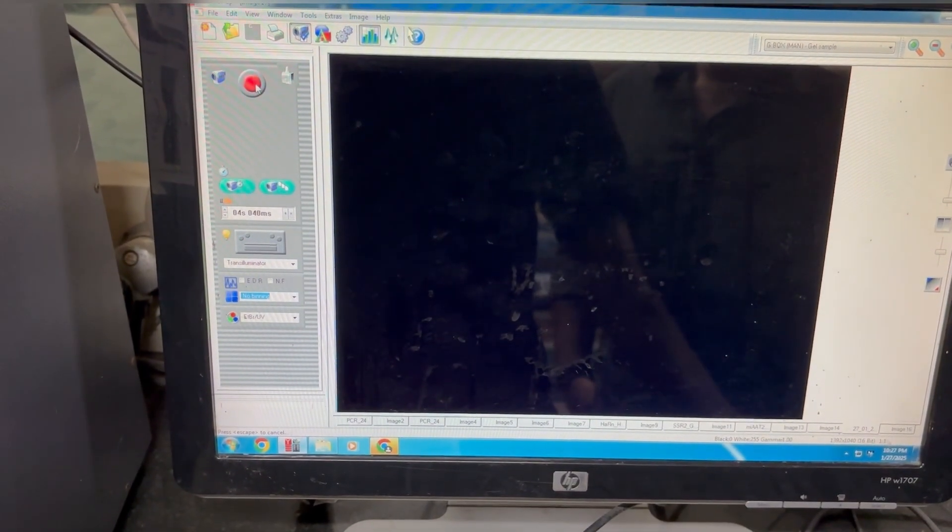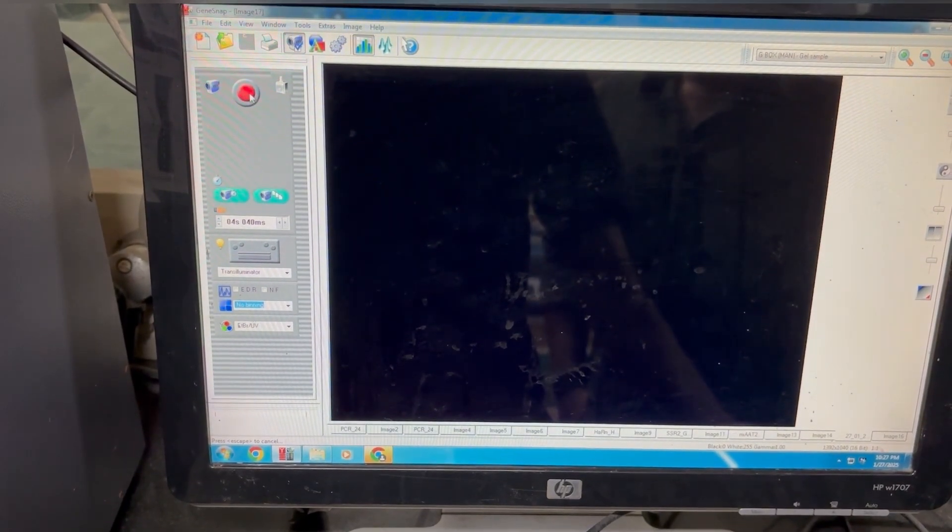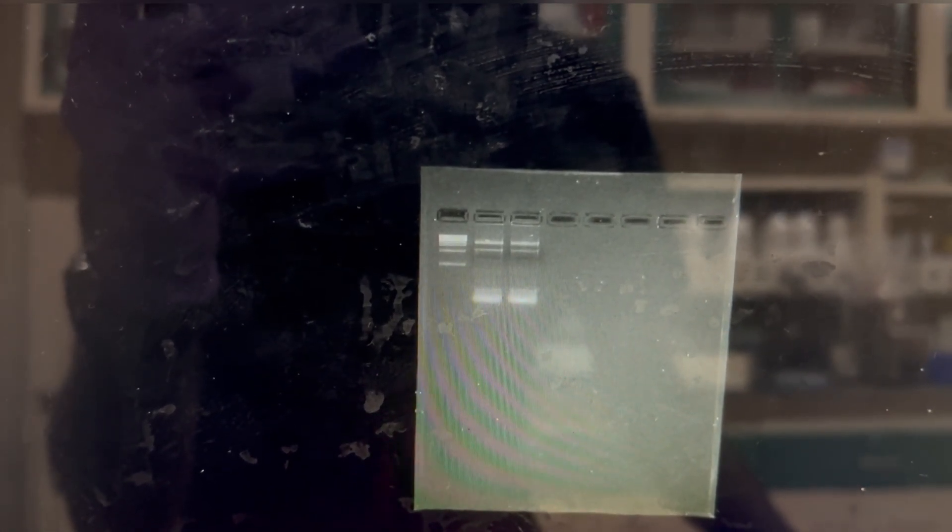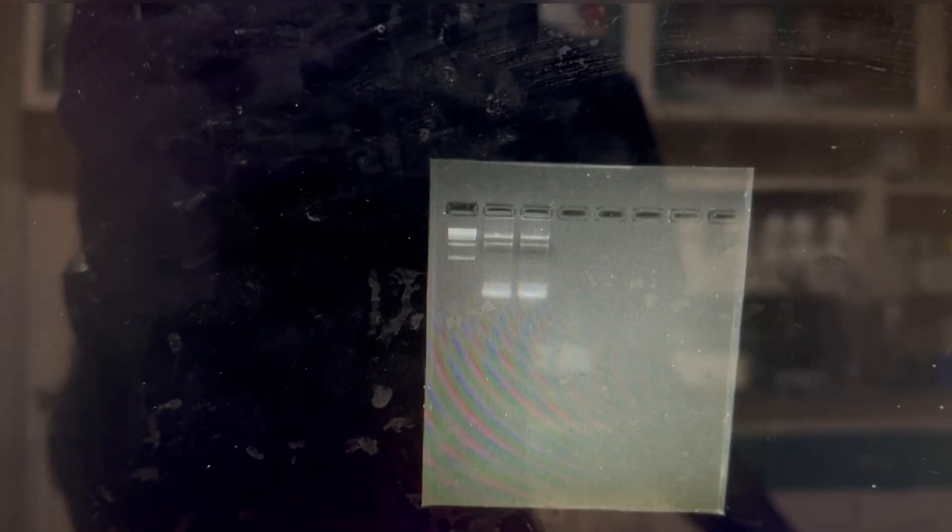Now it's time to check our RNA whether it has good quality of RNA or not. Here as you can see, there are three distinct bands suggesting good quality of RNA that includes 28S rRNA, 18S, and 5S rRNA respectively. And also I could not see any genomic DNA contamination.